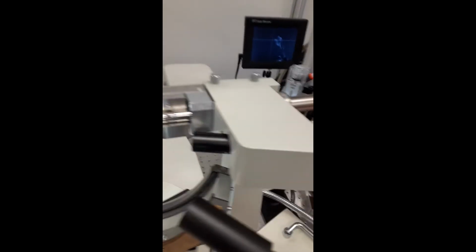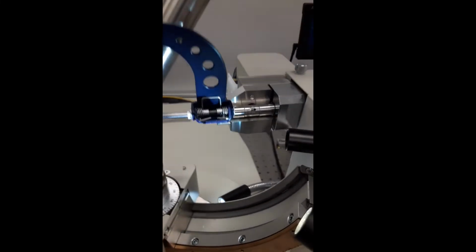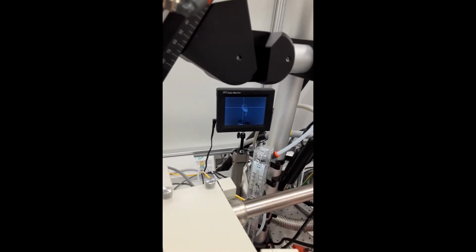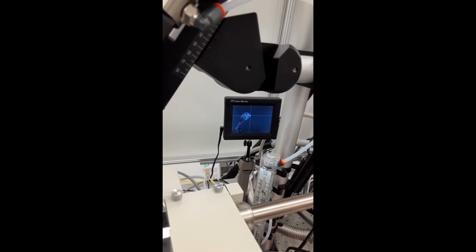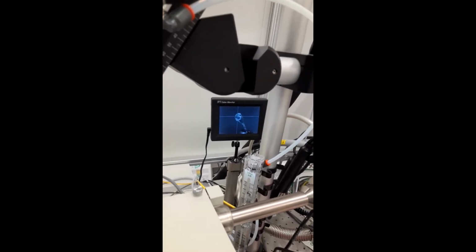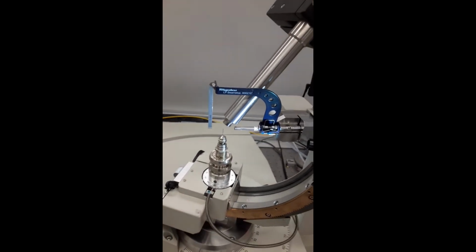And then using the camera angle, I'll use this tool to center the crystal. And now we can see it's centered on the crosshair. At that point we can lock the goniometer in place. And now we're ready to do the diffraction experiment.